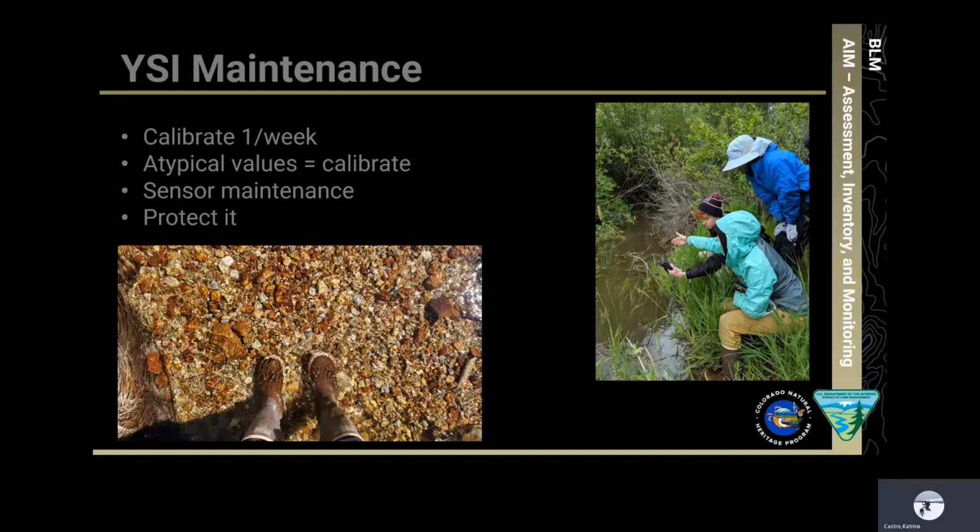Additionally, it is important to protect your YSI sonde from excessive sun exposure, rain, and always avoid exposing the machine to any liquid, including water and calibration fluid. Water can easily damage the battery ports of the machine and render it unusable. Additionally, it is recommended to regularly clean the sensors on the probe.